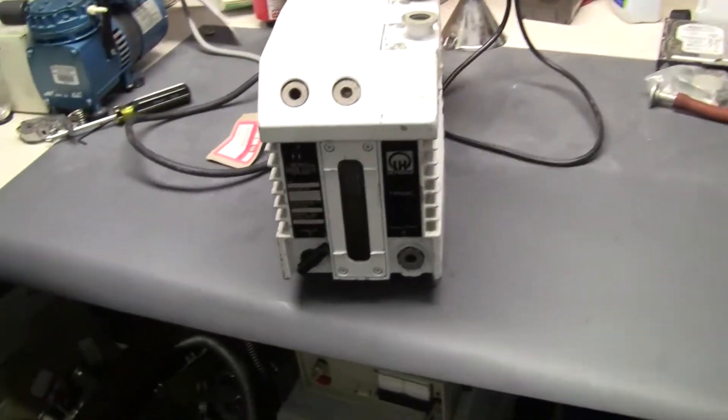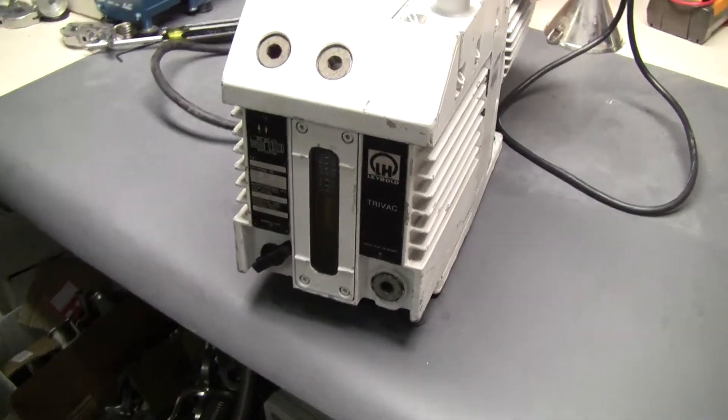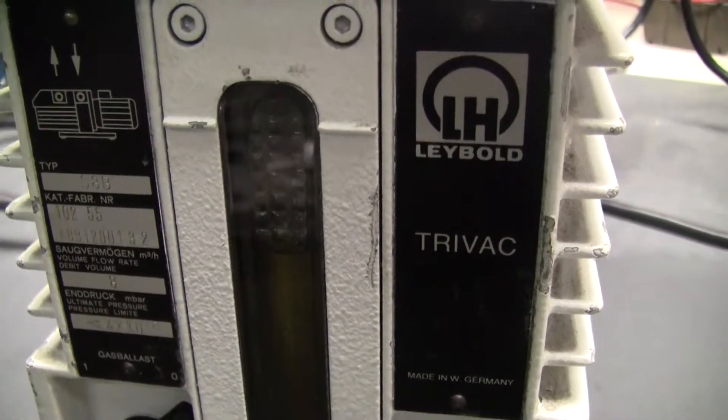Hi, this is Michael Natow from Hi-Tech Fitter. Today we're looking at a Labeled Poreas Tri-Vac vacuum pump. The model number is S8B.